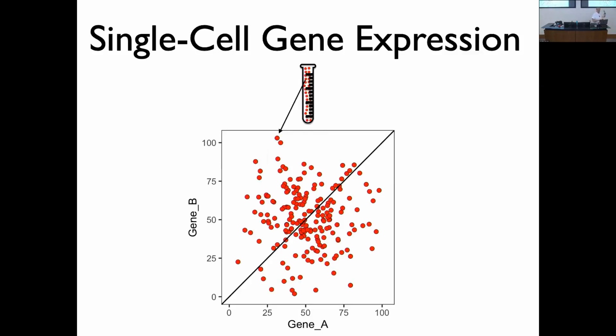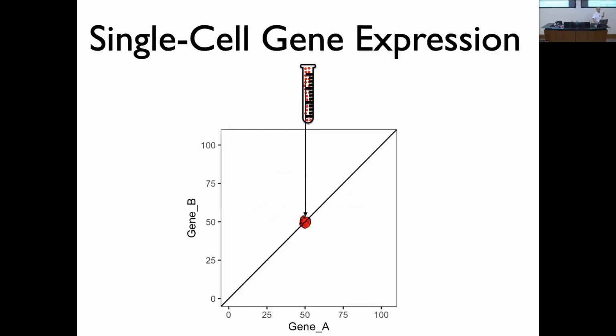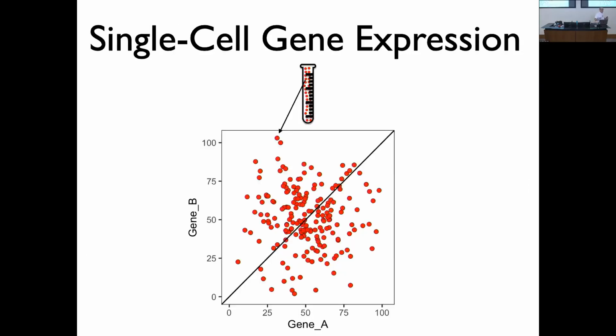So this distribution of gene expression is consistent with this bulk RNA-seq, but obviously this looks a lot different than this, right? And this is actually this sort of difference, the possibility that at a single cell level, gene expression might have much higher variance than you might capture from a population level measure like bulk gene expression has actually been understood for a while.